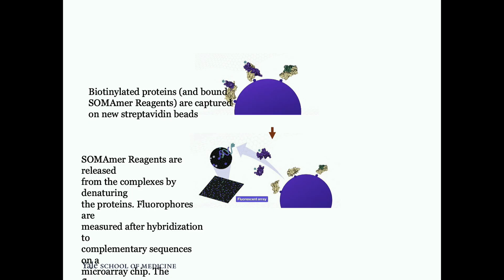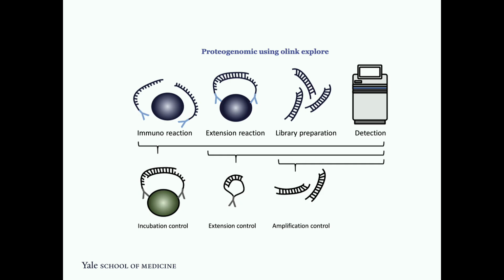There is another technique called Olink, which Dr. Amit was mentioning. You want to examine multiple proteins? SomaLogic can analyze up to 11,000 proteins in a single lysate. With 55 microliters of lysate, you can analyze up to 11,000 proteins. We need different types of aptamers, so it comes as a mixture, an 11,000 aptamer mixture. They have custom panels also, but the highest size is 11,000.